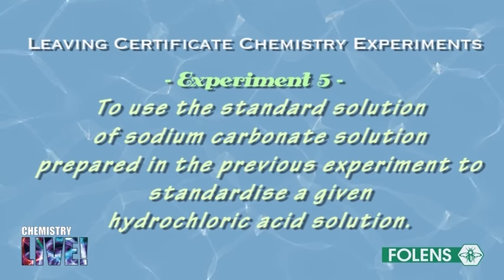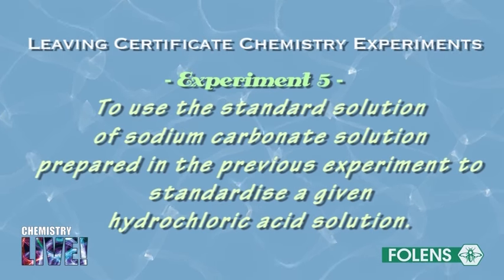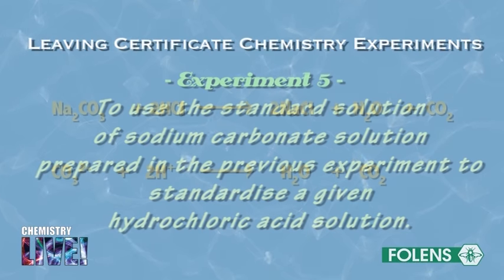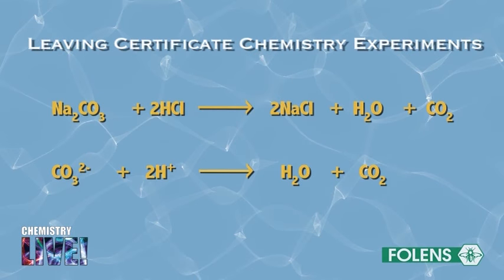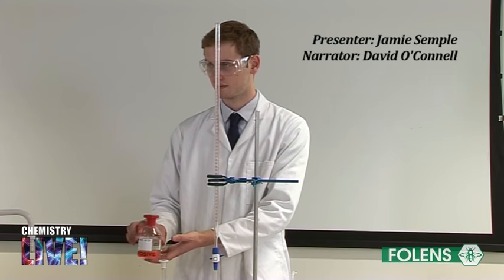Experiment: to use the standard solution of sodium carbonate solution prepared in the previous experiment to standardize a given hydrochloric acid solution. Sodium carbonate is a base that reacts with hydrochloric acid according to the equation shown on the screen. Essentially, what is happening is that the carbonate ion is accepting two protons from the hydrochloric acid to form carbon dioxide and water.